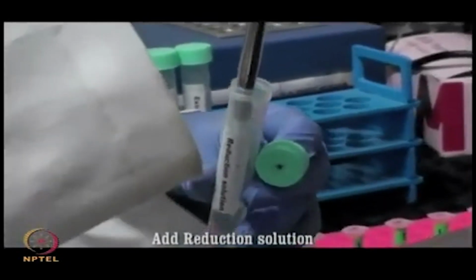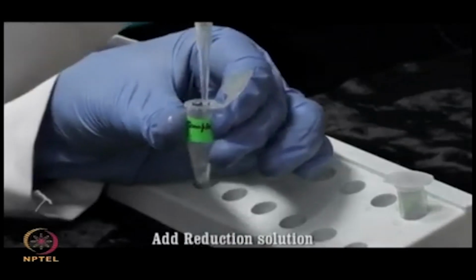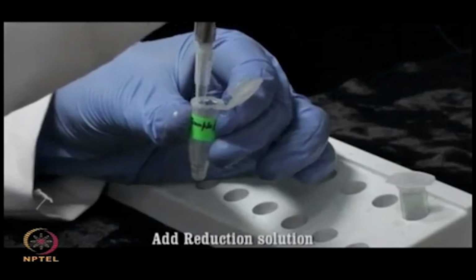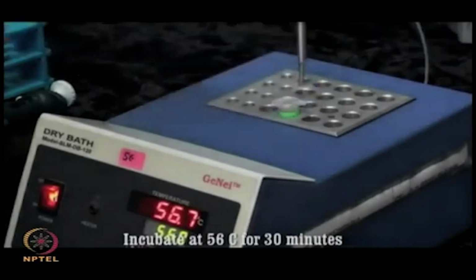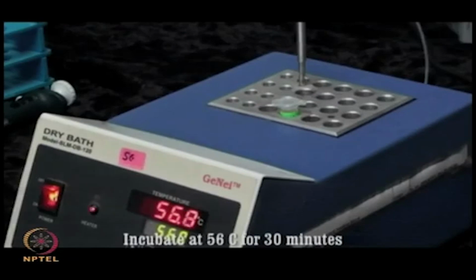Add 30 to 50 microliter of reduction solution to completely cover the gel pieces. Incubate it for 30 minutes at 56 degrees centigrade. Treatment of protein residues with dithiothreitol breaks the disulfide bonds.